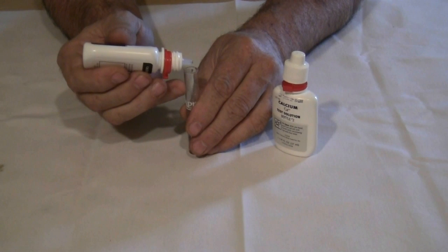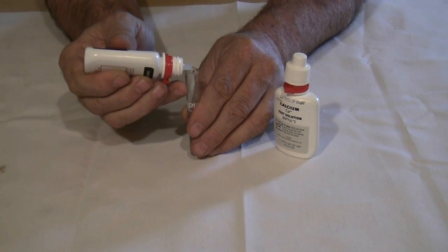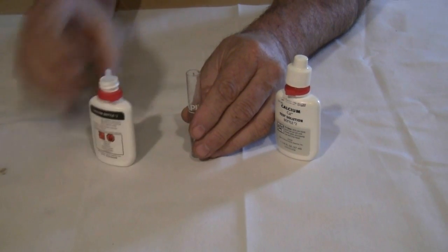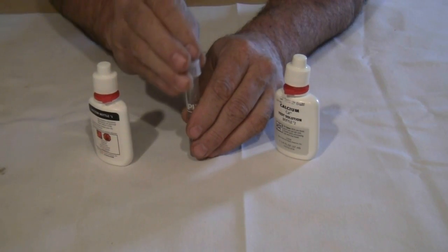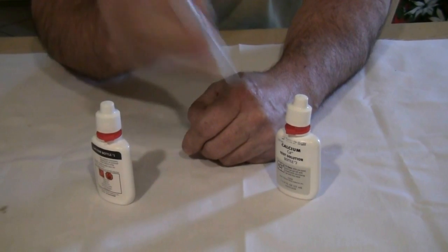One, two, three, four, five, six, seven, eight, nine, ten. After we do that, reseal it and shake vigorously for about ten seconds.